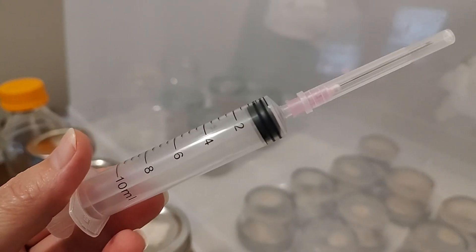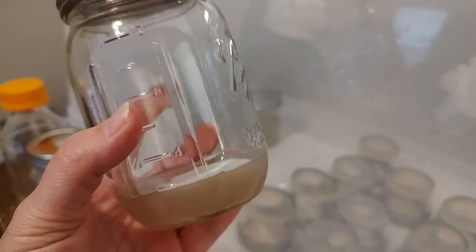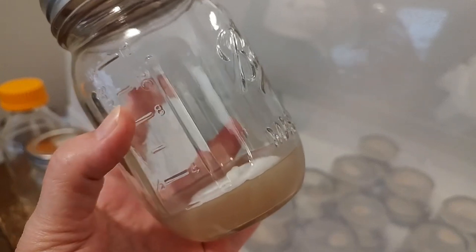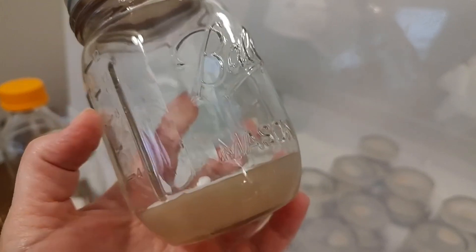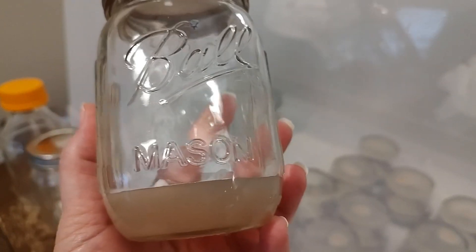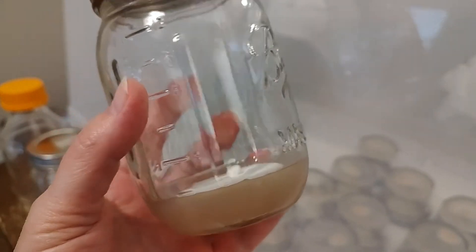You can also clone fresh or wet fruits. So no matter what mushroom you're wanting to grow, if you can get your hands on a wet, fresh version of that, you can clone it. Whether you have the wet or fresh mushroom, you can clone. Whether you have the spores, you can turn the spores into mycelium. And that's what we recommend, because you're going to be so much happier with the fruits from mycelium.